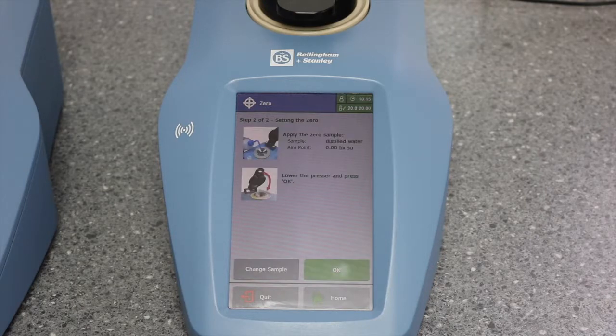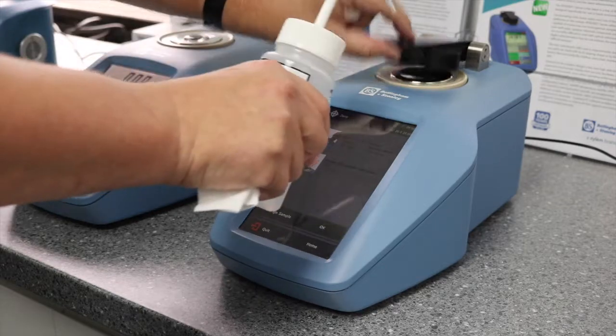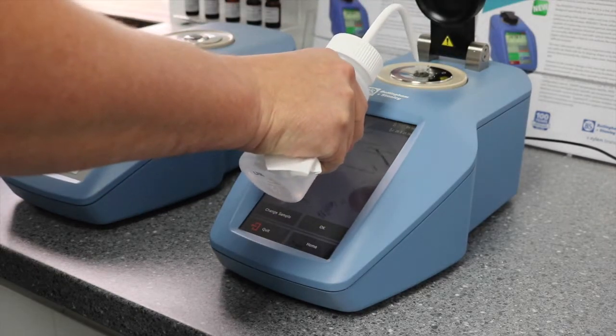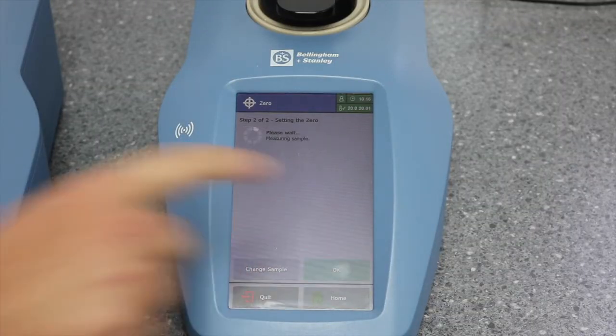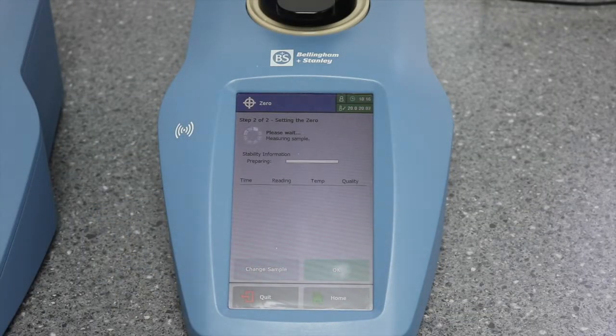Choose your calibration solution. In this instance we should be using distilled water. Apply the sample and press OK. The instrument will now check the sample temperature and wait for sample stability before giving a final calibration reading.